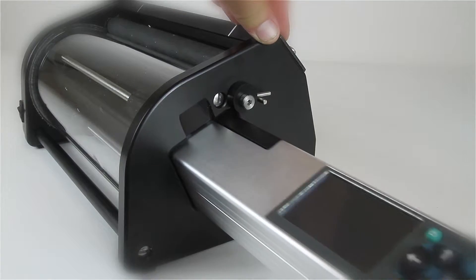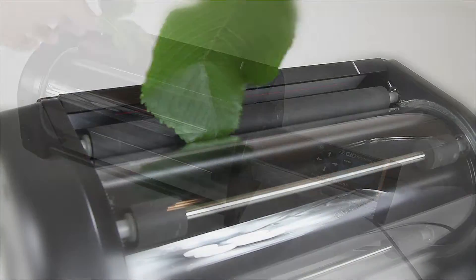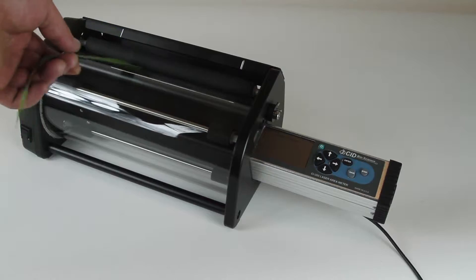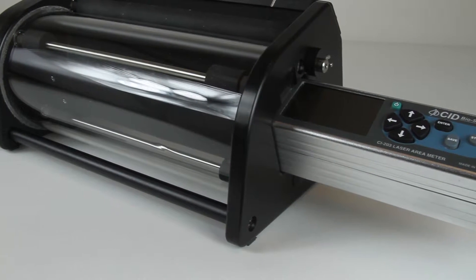For measuring large numbers of detached leaves, an optional conveyor attachment is also available. The conveyor attachment is a perfect solution for whole-plant high-throughput phenotyping studies.